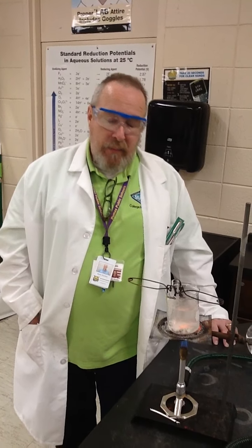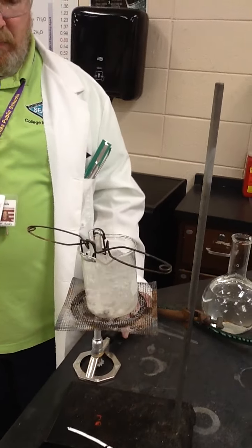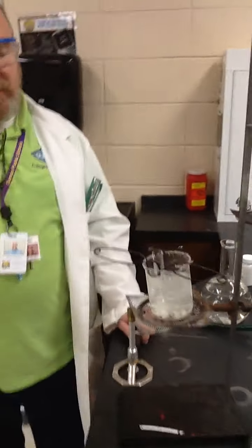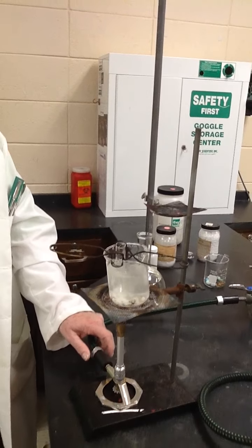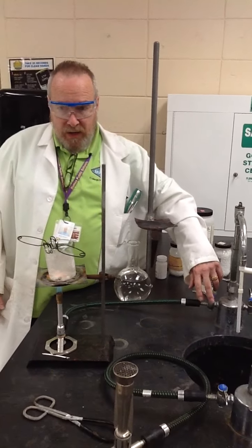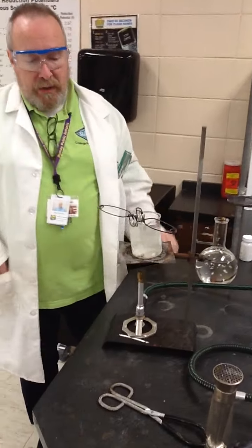If you look, it is now boiling vigorously. We can control the rate of boil by turning down our flame, pulling our flame in and out, or by moving our whole ring stand up. But it said to boil for several minutes, and that will be fine. I'm going to turn my burner off at the petcock. Don't blow it out like a birthday candle. And you can see it's still boiling.